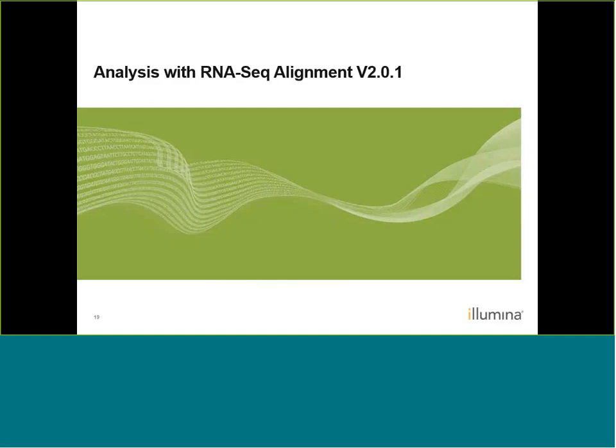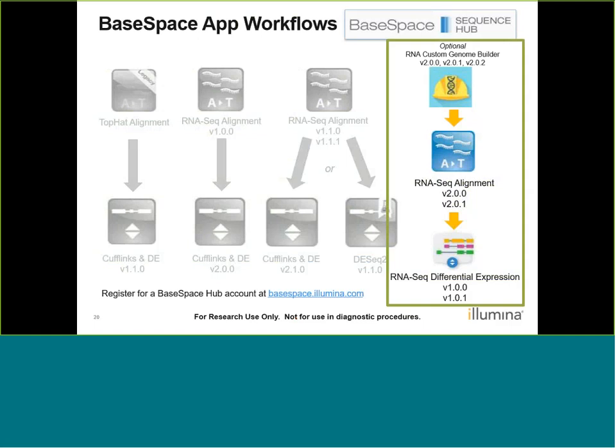So now that we've given that option for you if differential expression and novel transcript assembly is your goal, let's switch gears and talk about our newest analysis. So let's detail our RNA-Seq Alignment version 2.0.1 app. Again, we're going to be following this specific workflow in greater detail.